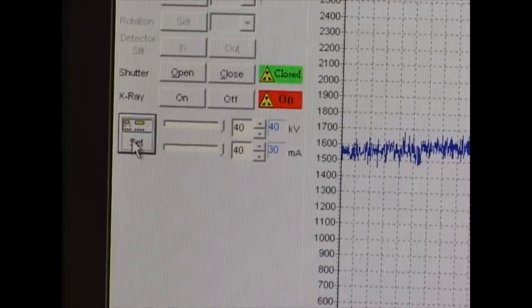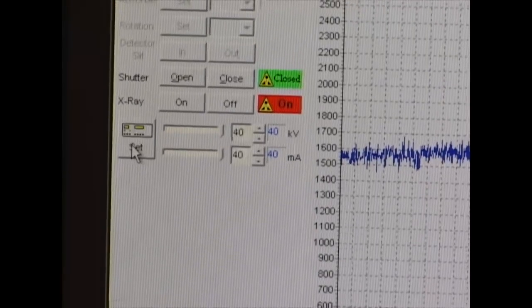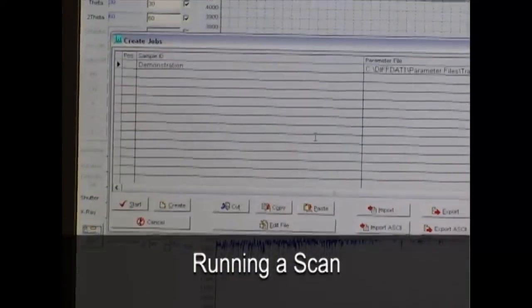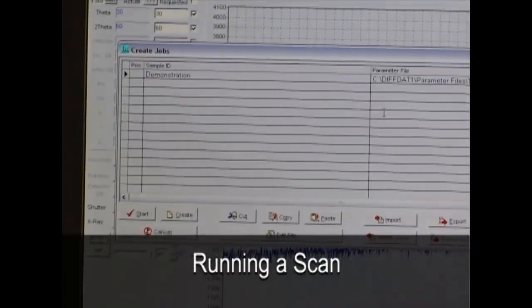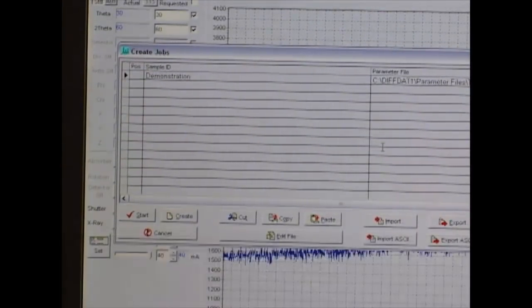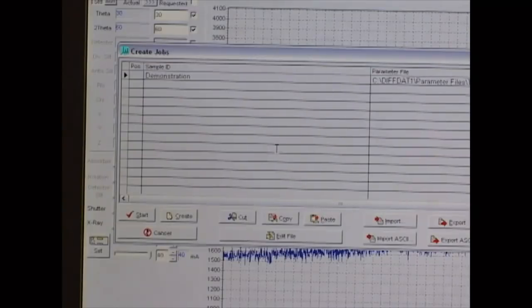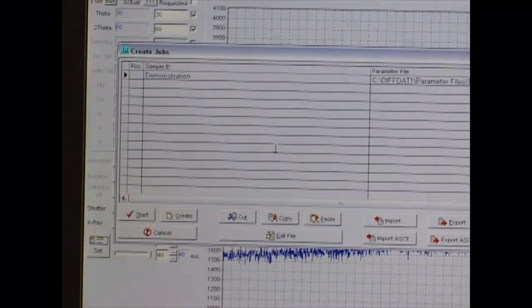Okay. Now, it's actually up to maximum power. And I can go ahead and run my sample. I recommend that you wait five minutes or so while it's at maximum power. I have run a number of scans at different times after getting it to maximum power and have noticed a small change in maximum intensity. But for now, since we're just doing a demo, I'm just going to hit the start button right here.